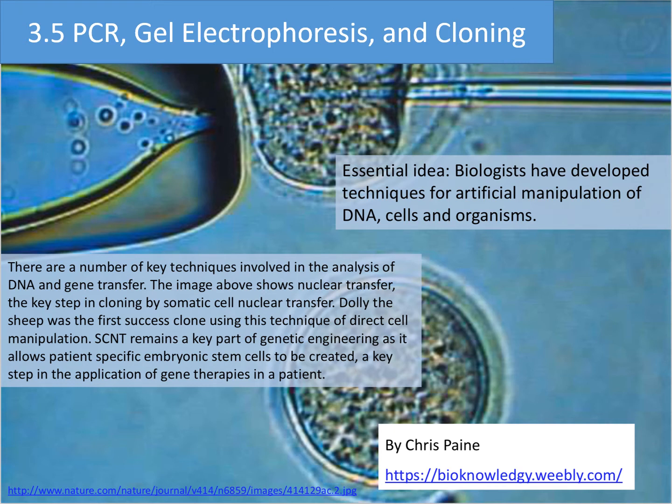Today we'll be looking at topic 3.5 and we'll be reviewing some of the important techniques that are used in the process of making genetically modified organisms. So we'll be talking again about PCR, something we did cover back in topic 2, but also applies here in topic 3. We'll be looking at gel electrophoresis and how gel electrophoresis helps us to find specific sections of DNA, or how we can use it to create banding patterns of samples in order to compare DNA samples and kind of use them for DNA fingerprinting.